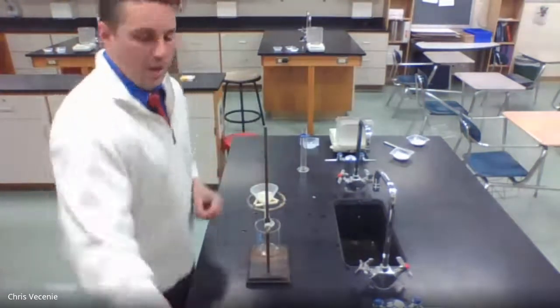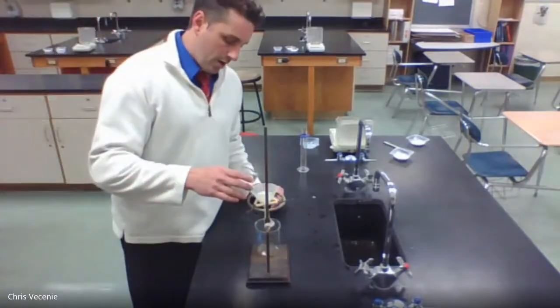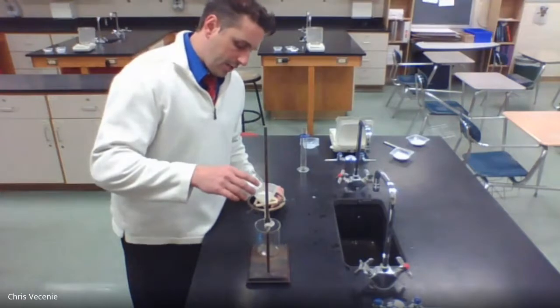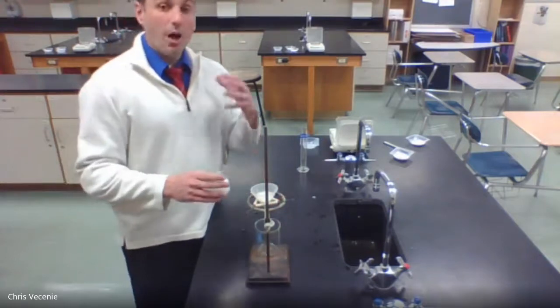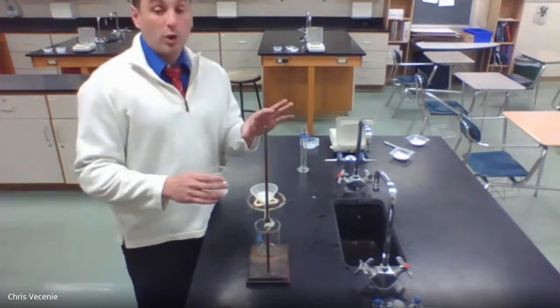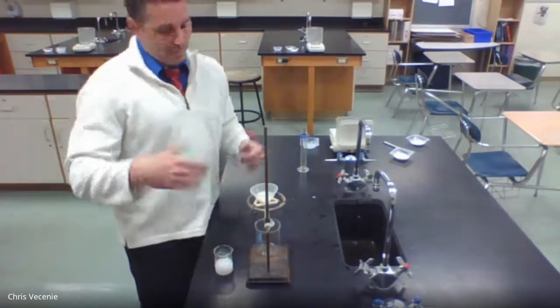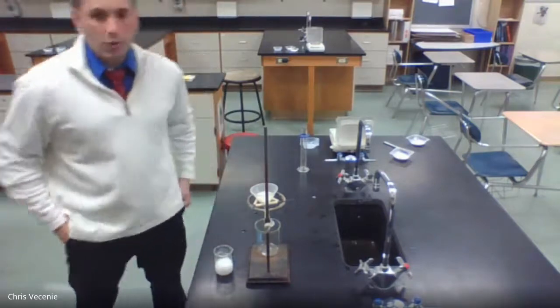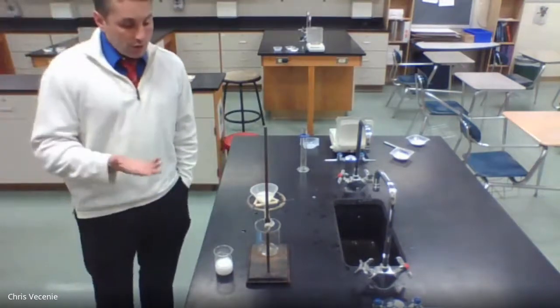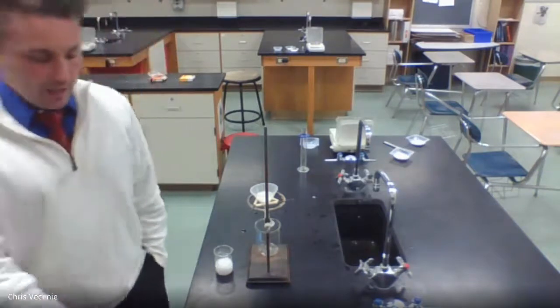All right, and now we get to the tedious part of the process. I'm going to pour this liquid in here. And I need to make sure that it stays below the filter paper, because if it goes behind it, that means white solid is going to drip down into our beaker below. So a good thing to do while this portion of the experiment is going on is to jump to your post lab.